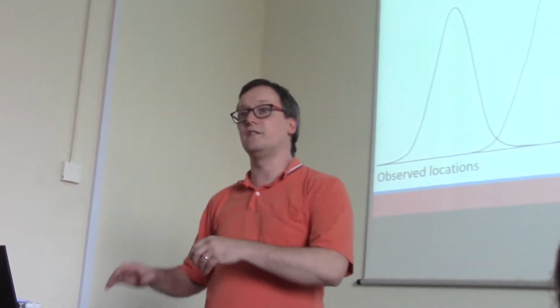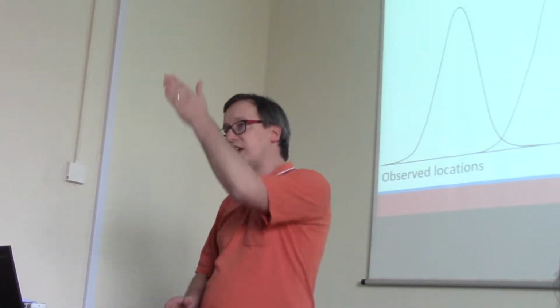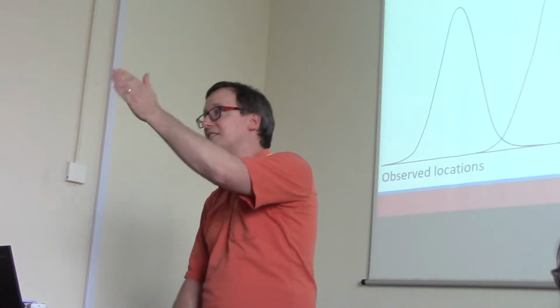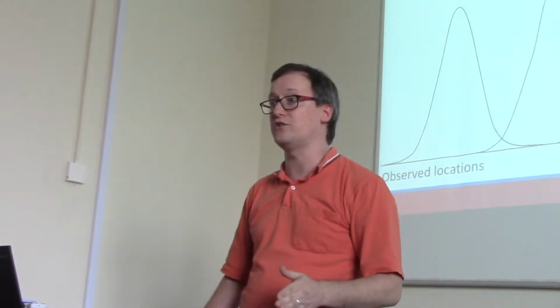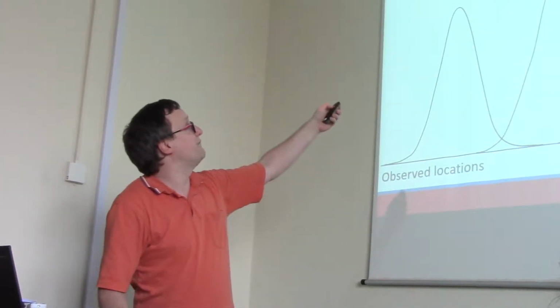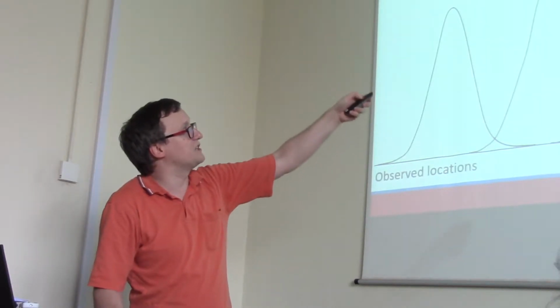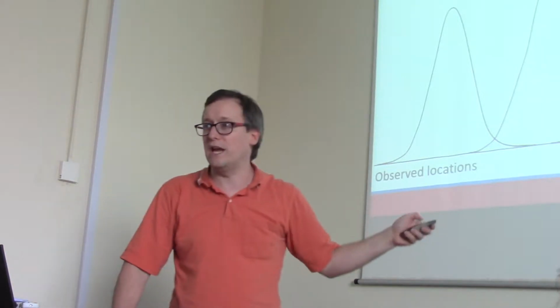This is to say that Fourier Transform has looked at the overall signal and feels that we have hits on where the peaks should appear at these regularly spaced locations. And it knows how big a distance it expects between successive locations. So from FT, we have these predicted 4 locations. These, however, are the data that we have.